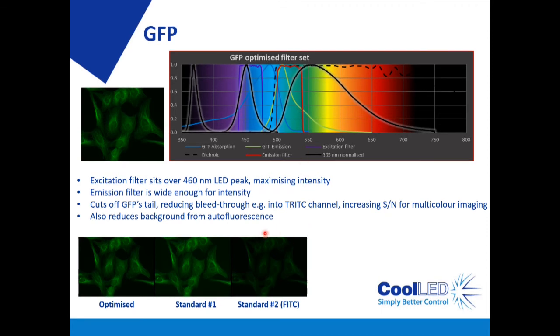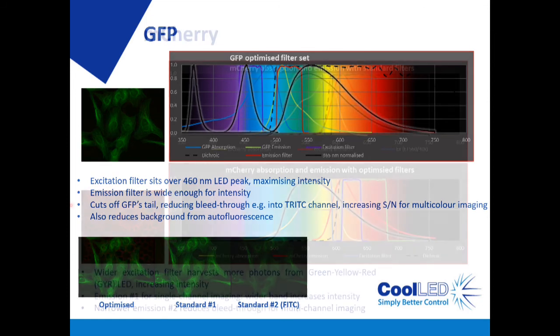You can see here the images are side by side. It is evident that our optimized filters result in a significant improvement in image quality. It's also worth noting that these were captured with exactly the same setup and exposure, with no contrast adjustments.